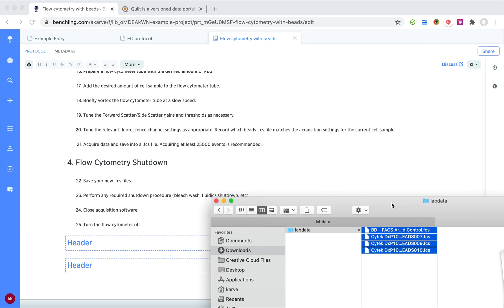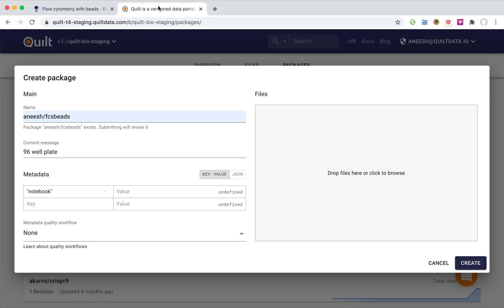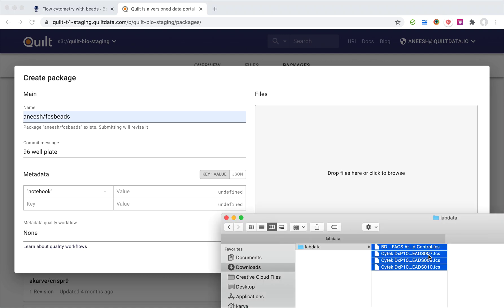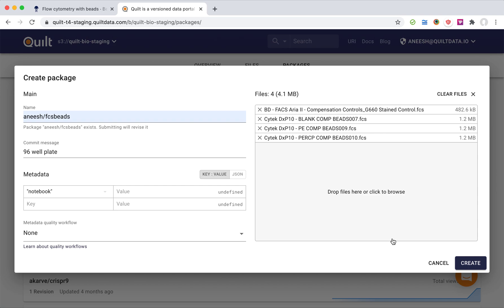So what I'm going to do is open up Quilt. Quilt really is a dataset complement to the notebook. The notebook has maybe really lightweight data figures, it's a journal of my procedures and my methods, but when I want to store heavy datasets I can actually put data of any size into Quilt.